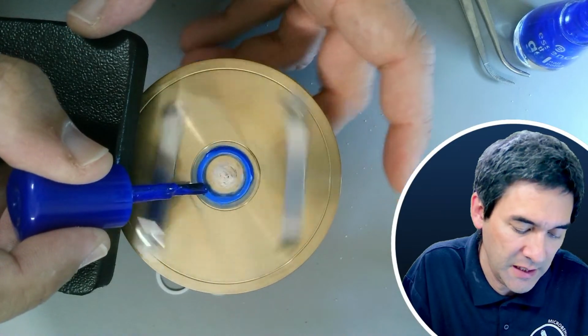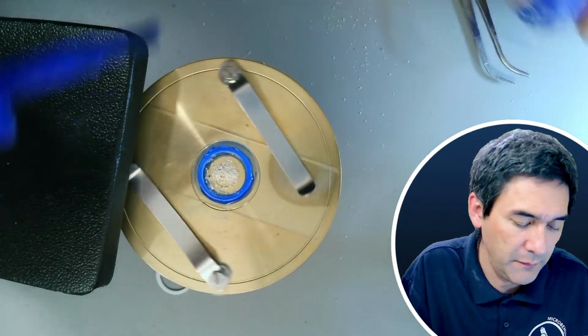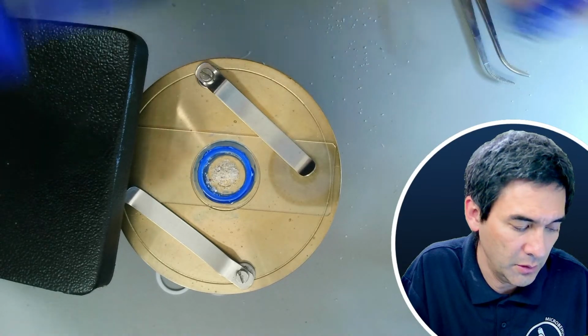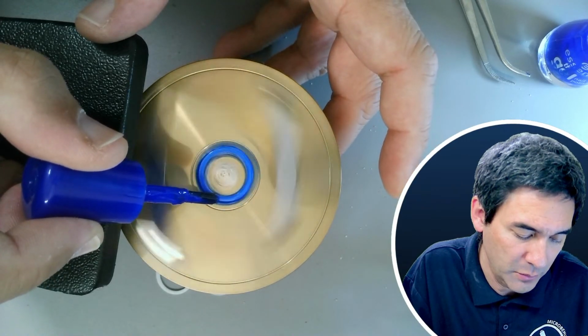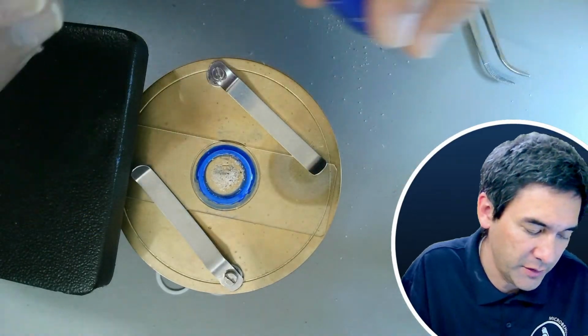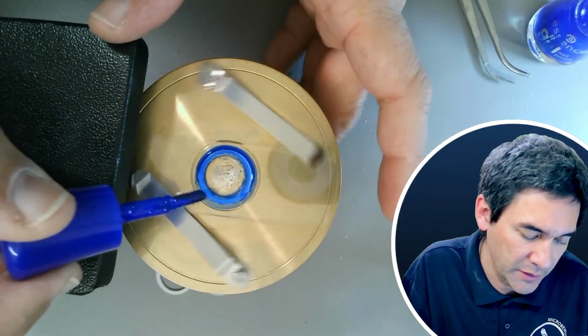Honestly, this is highly experimental. I've never seen anywhere on YouTube anyone trying something similar here. So if you have any advice to share, there is a comments section, or maybe you have links to other YouTubers who have been doing something similar. Okay, so let's share the knowledge a little bit. That's kind of my suggestion. Ooh, now this is a lot.